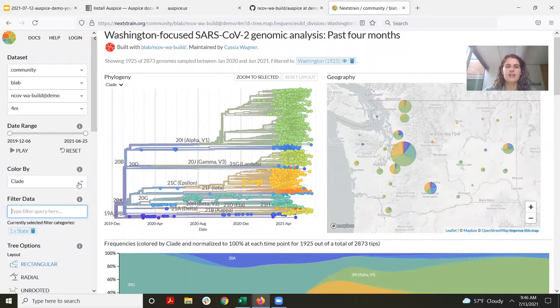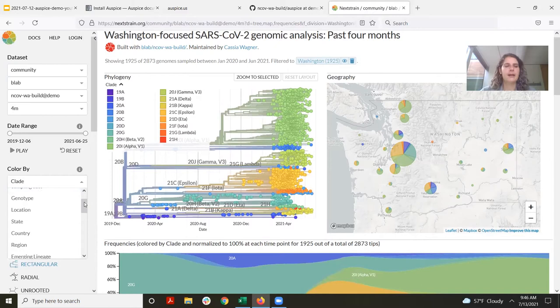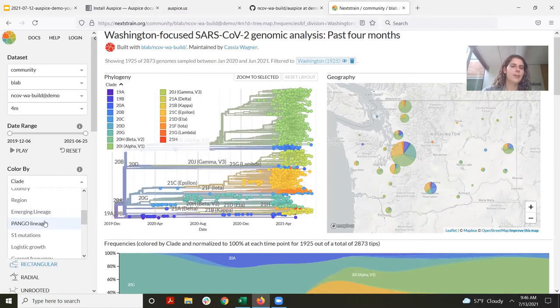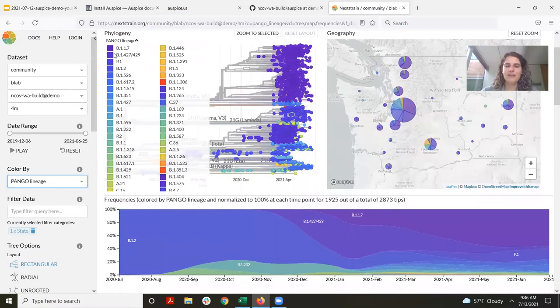In addition to filtering, I can also change what I color the tree by. Right now we're coloring by Nextstrain clade, which I'm familiar with as a Nextstrain team member, but not everyone is. You can color by other things as well — geographic variables like location, state, country, or region. You can color by Pango lineage, which is a classification that many people are quite aware of. It's not one I often use in Nextstrain because there are so many Pango lineages that it can be difficult to keep track of.